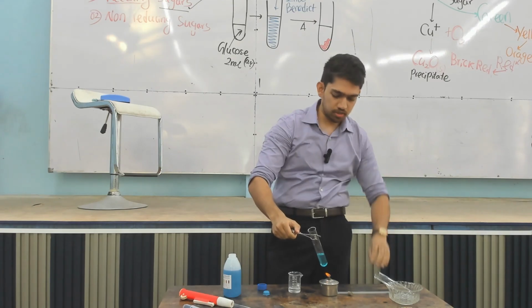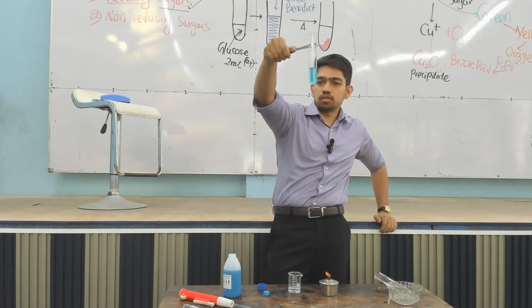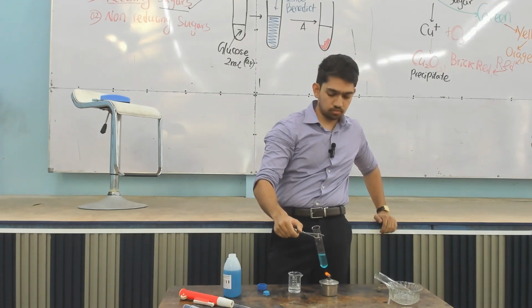Always basic lab safety. So what is the color? You can see it's blue colored, no? Right. That is because of the aqueous copper 2 plus. So let's see what's going to be the color. Always heat everything away from your face.